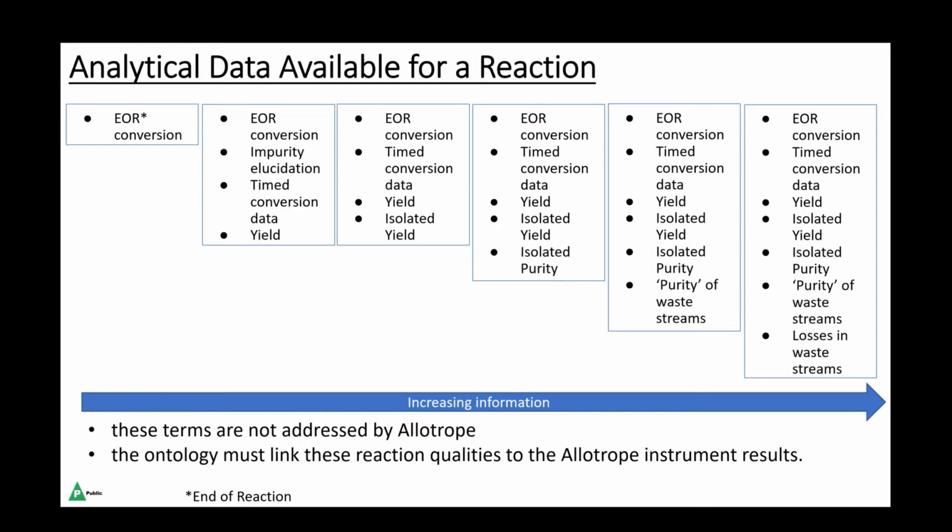it represents. The second thing to notice is the amount of testing and the understanding of that testing increases throughout the project development. Initially, relatively little testing may be done in the discovery space, with more and more being done as the project moves towards clinical trials and hopefully eventually manufacturing.